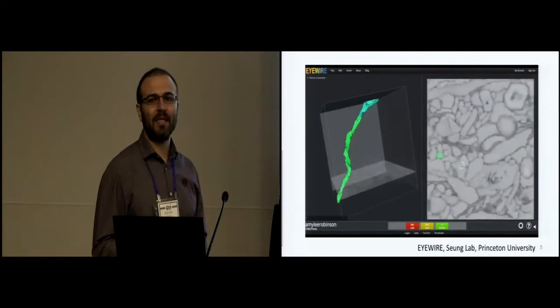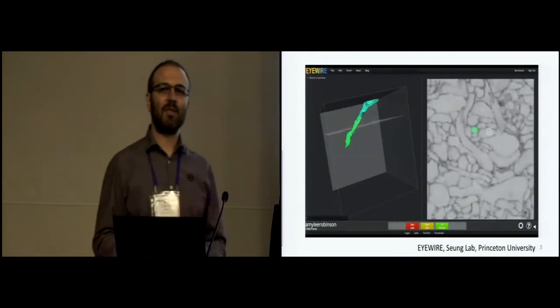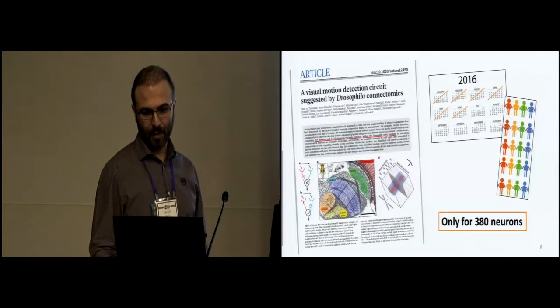In this talk, I will present not the manual annotation case, but the gaze input case. Our system is called iTrace, and I will also talk about our user experiment results.